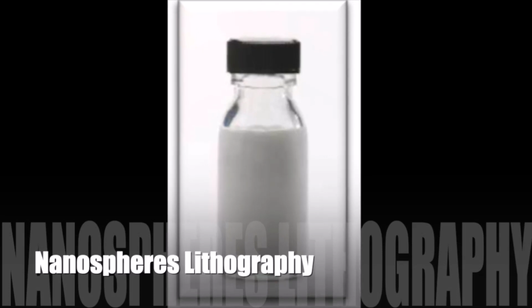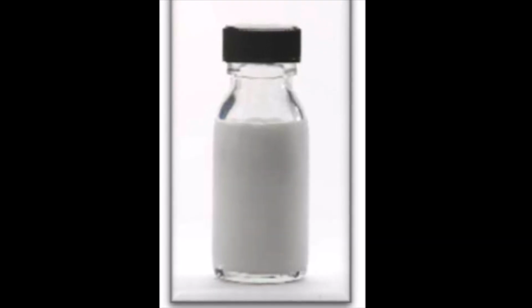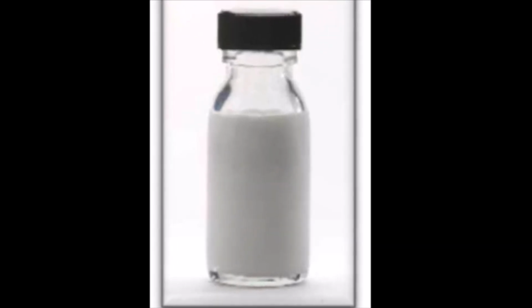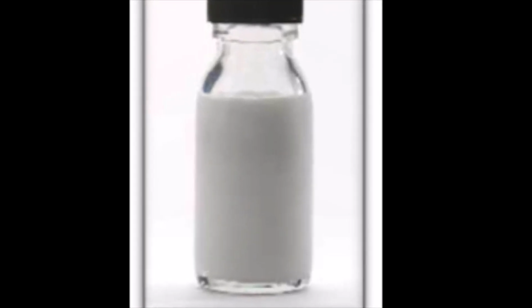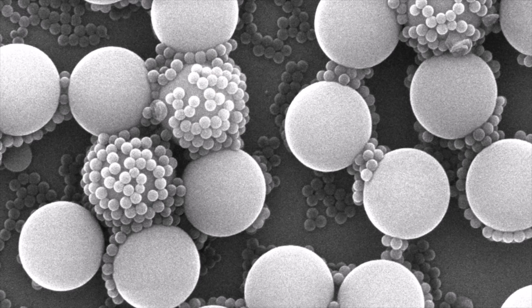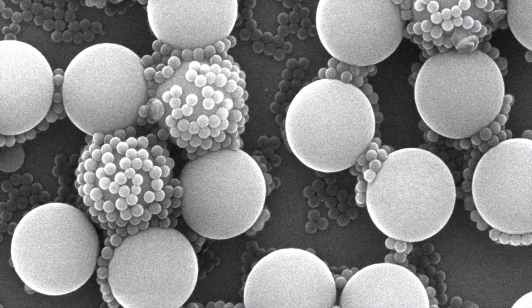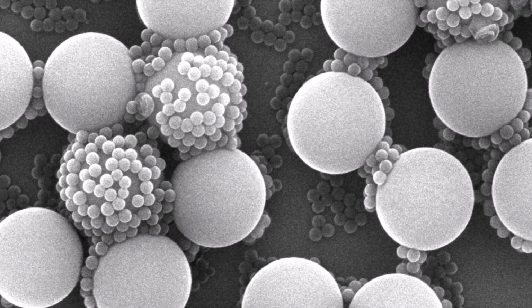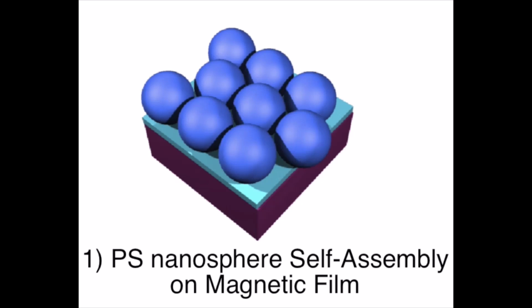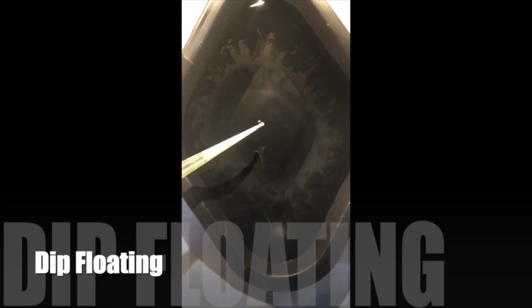We conclude our tour with nanosphere lithography, a bottom-up technique allowing us to reach dimensional resolution down to 80 nanometers. Polystyrene nanospheres are commercially available in different dimensions. This is a rapid and inexpensive technique to pattern large film areas. The process requires depositing a single layer of polystyrene nanospheres on the film surface. This can be done in two ways.